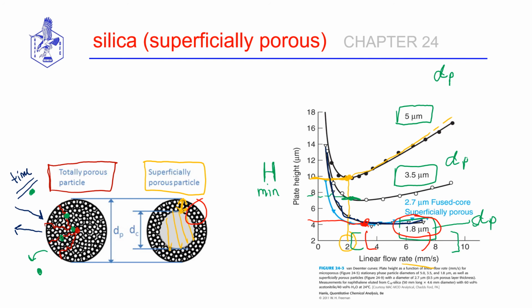You will notice this light blue Van Deemter plot for the superficially porous particles. Okay, we get the advantage of optimal resolution.